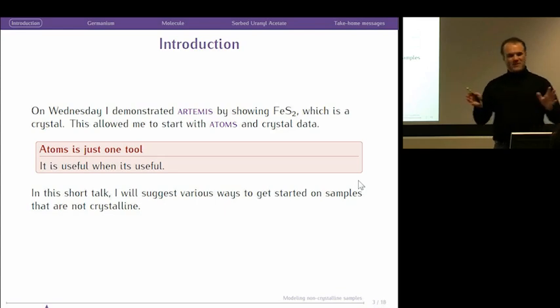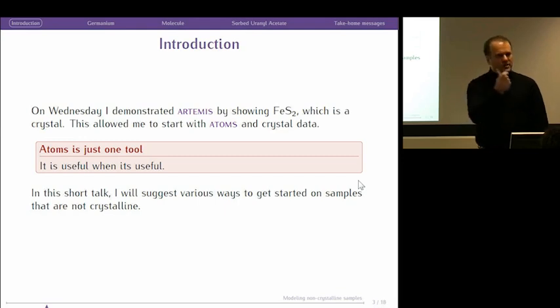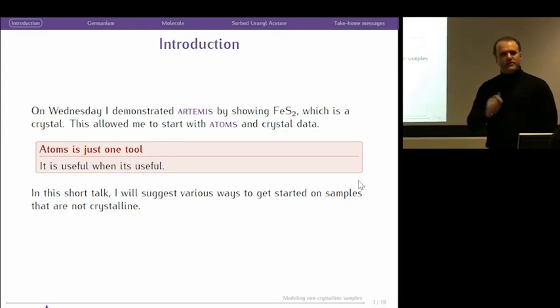If you have a crystalline material, awesome. Start with the crystal structure. If you don't have a crystal, then what? Well, you have to do something. So here I'm going to give you 3 hints about how to get started with non-crystalline materials. And the thing I want you to keep in your mind as I go through these 3 examples is that the problem is actually simpler than it seems. Getting started on almost any XAFS problem is usually pretty tractable. It's usually not that hard.